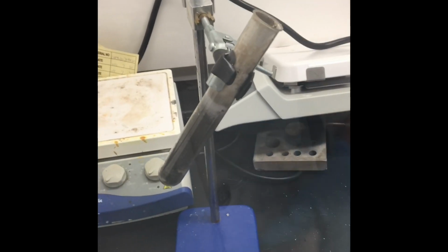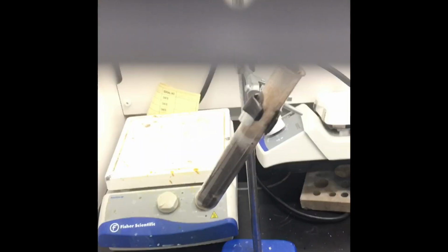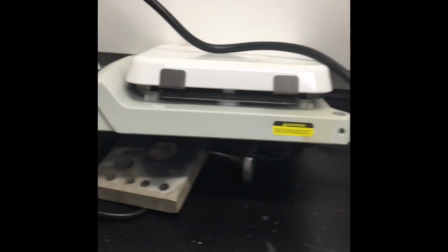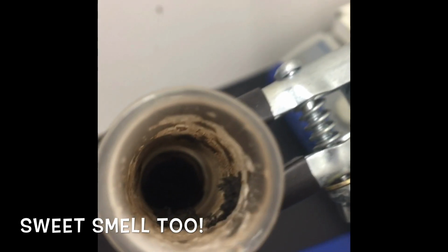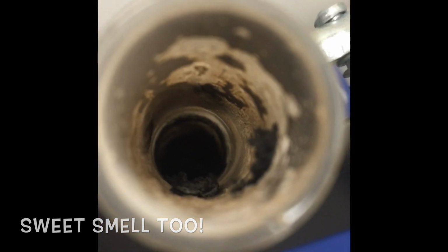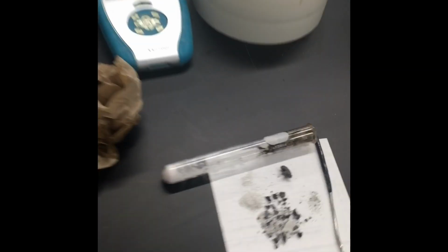This is absolutely awesome. So let me see, we can see how it actually looks from the inside. Let me fix this safely now. Ooh, it smells really burnt. But you can see how it looks inside. And I'm going to show you, okay? I'm gonna go over here.